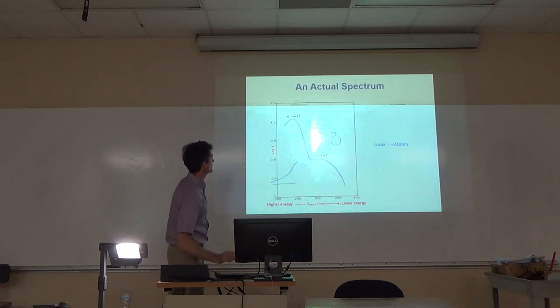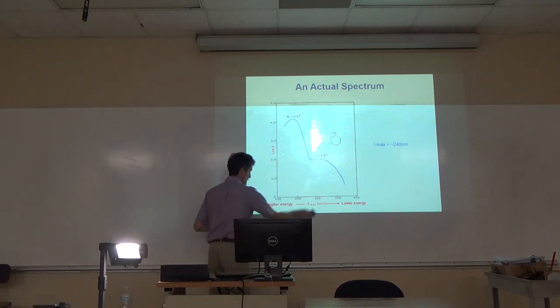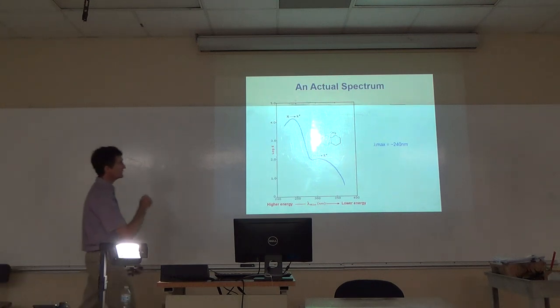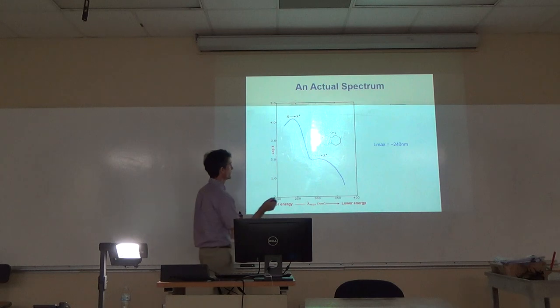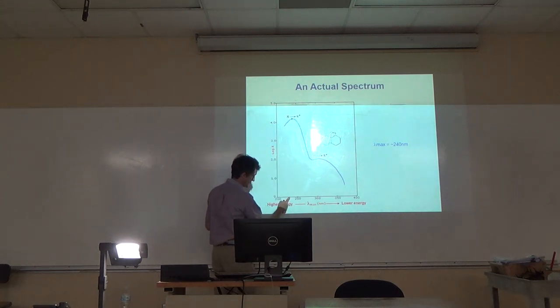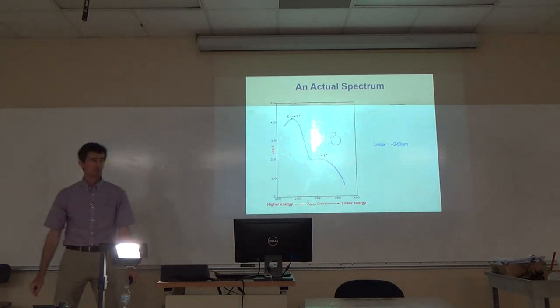Here's another UV-Vis, a different compound. What type of electrons does this compound have? All three types? Yeah, I see lone pairs, pi electrons, and sigma electrons. All three types. What's the lambda max for this compound, the wavelength of maximum absorption? Right here, which is about 240. Here's your lambda max for this compound.